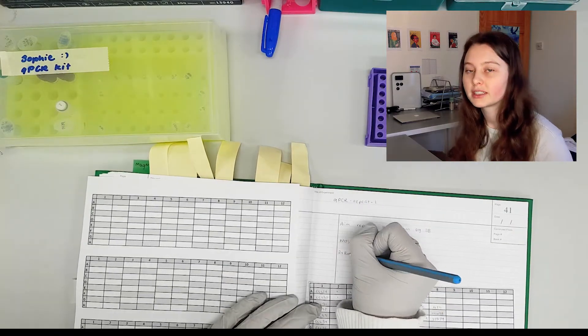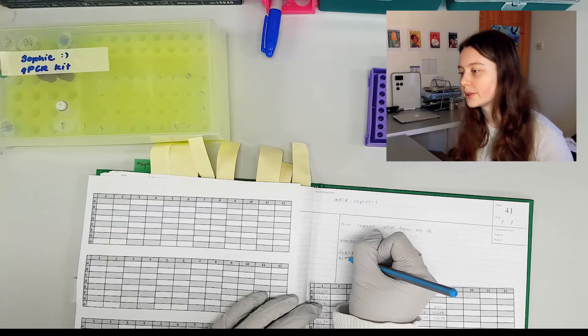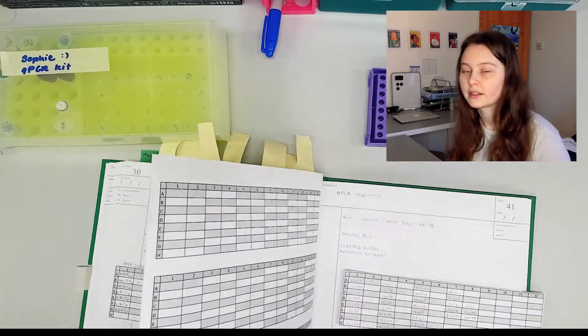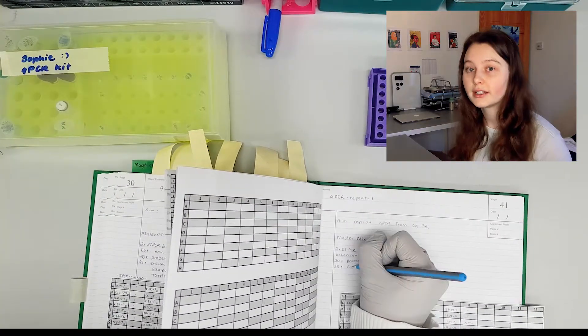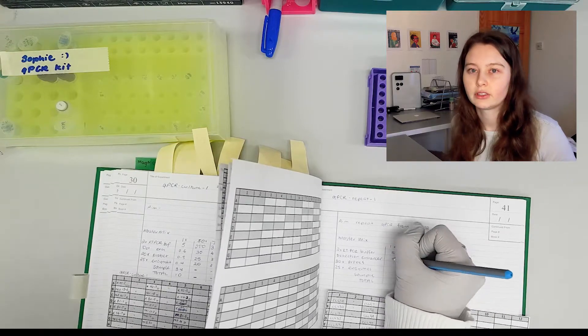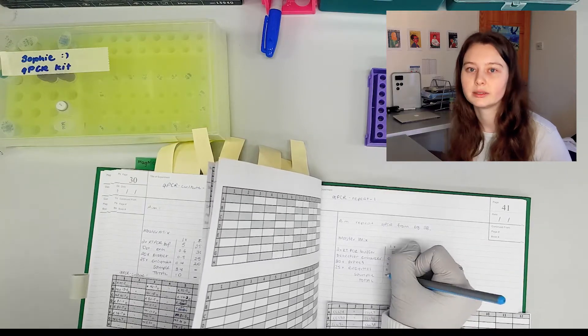So you can see I'm now writing out my master mix calculations. That's going to include my buffer, my enzymes, my probes. There are different things you can add depending on what you're trying to do, what concentrations you're using, or what kit you're using. So I don't want to give you exact volumes because it's going to be different for you.